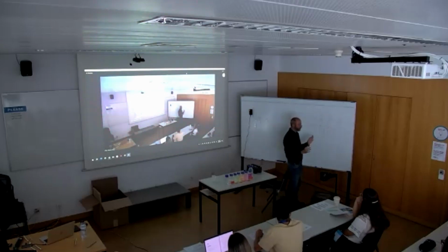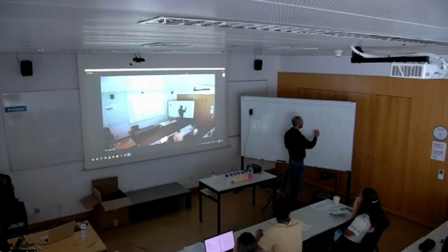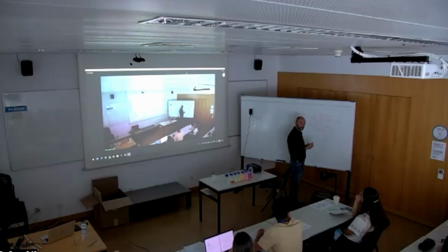So it's much easier to collect the information in the diffracted beams for coarse features, because the diffracted pattern is smaller and will fit inside the numerical aperture, the angular aperture of your objective. But with the same angular aperture, there will be a limit. We will collect the zero order that is generated by the very tiny features, but we will not manage to get in even the first order of diffraction generated by those tiny features, because the tinier the feature, the farther away will be the first order of diffraction.